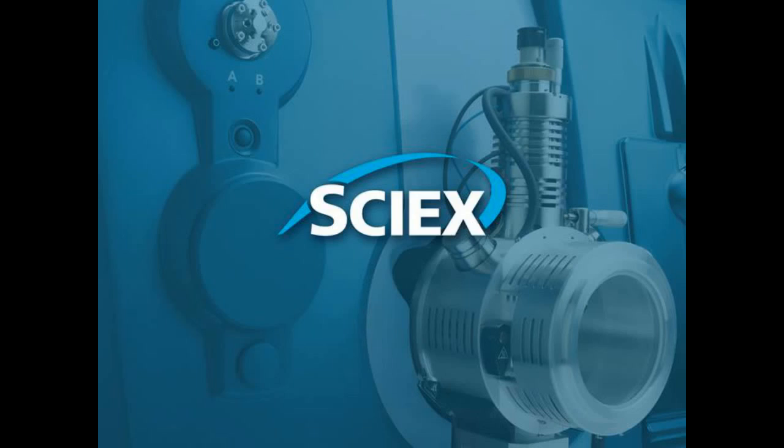Great, thank you. Our next question, how easy is it to connect the CESI to a mass spectrometer? It's very easy. Basically, all you need to have is a nanospray source and an adapter which allows you to connect in the OptiMS capillary. I actually now use a CESI instrument as a nano infusion device over connecting a syringe, because all you simply do is plug in the OptiMS adapter into the holder onto a nanospray device and apply pressure, and you're running. It's really very simple. I can do it in about 5 or 10 minutes typically.